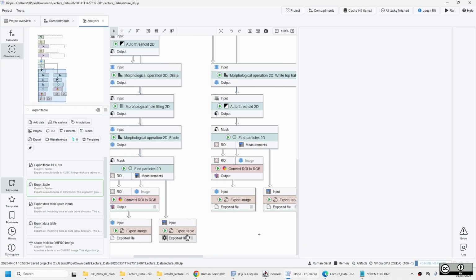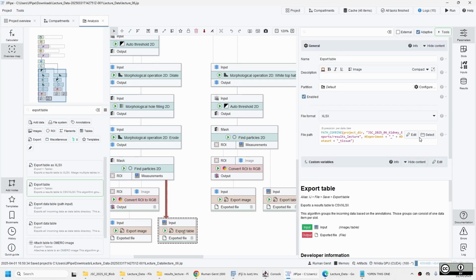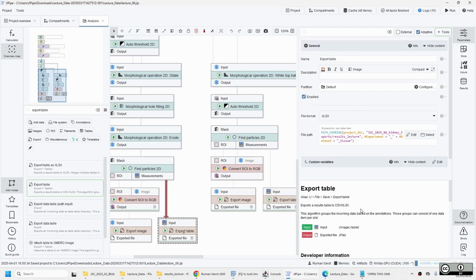There are also references, and of course, everything is uploaded in the directory if you need some help and guidance with these. This way, we can also have these project directories as well later on, because we can absolutely use these inside these expressions. So they are available as variables that you could just use instead of project directories.